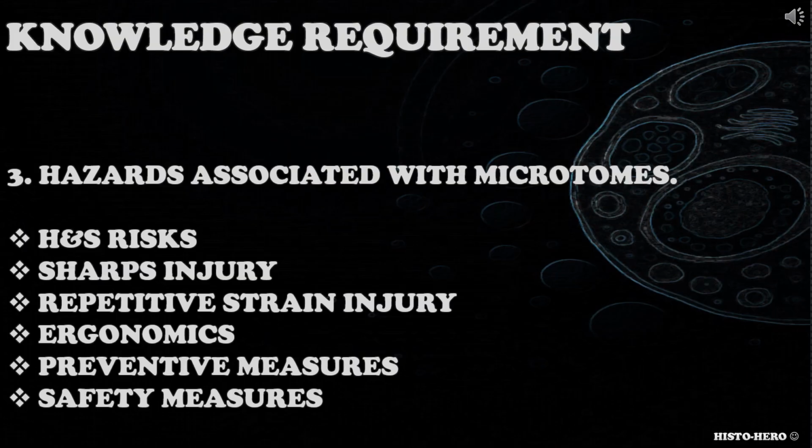The third knowledge requirement is hazards associated with microtomes. Candidate needs to have the knowledge and understanding about the hazards associated with microtomy. You could ask the candidate to explain what the hazards associated with microtomy are, how these could be minimized or avoided, what the best way of setting up a microtomy station would be, and so on.